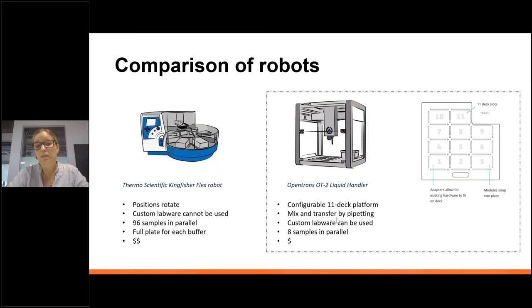On the downside, it runs with an 8-channel pipette, so we can only process 8 samples in parallel. So of course there is an issue with speed compared to the Kingfisher and also the Bravo illustrated in Philip's talk. But on the other hand, it's very cheap, and it's nice to get started with. So what we want is to integrate the Evosep loading and transfer the PAC workflow from the Kingfisher to the Opentrons, so we can have a fully automated end-to-end workflow.